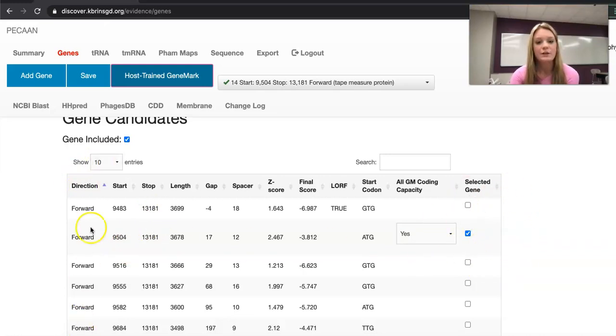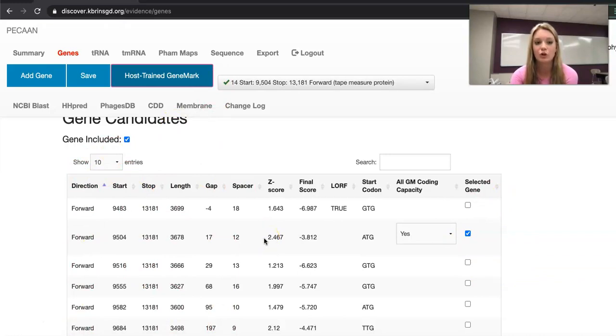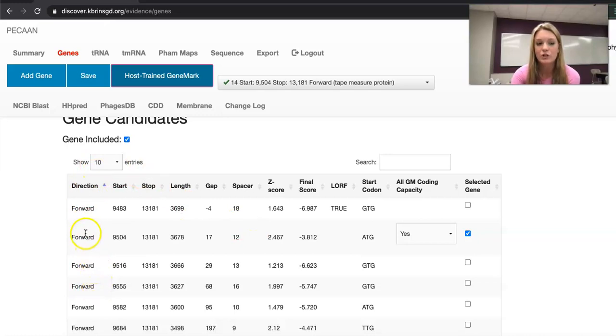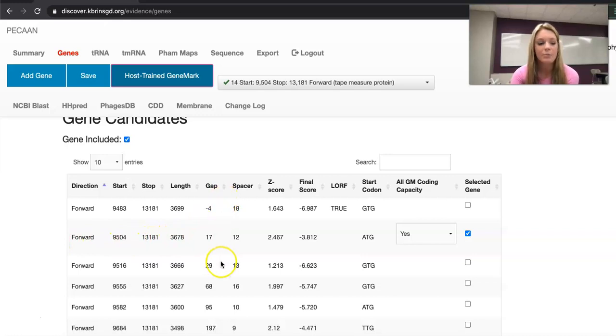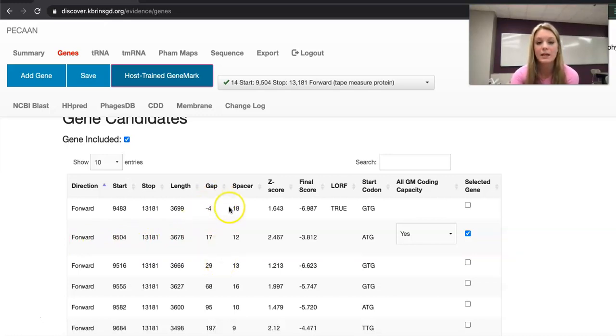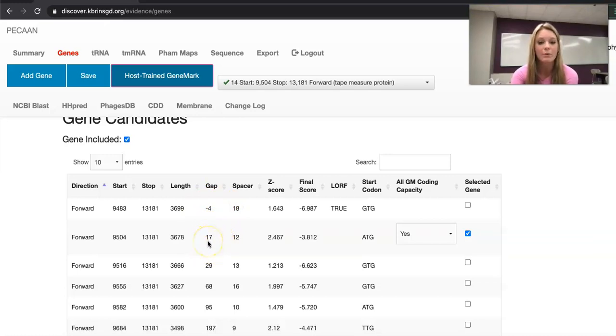Each of these different columns shows different information for each start. This shows the forward or reverse, in our case it's forward, the start, the stop, the length, the gap - a negative indicates an overlap, in this case it would be an overlap of 4, a positive indicates a gap, in this case it's a gap of 17.